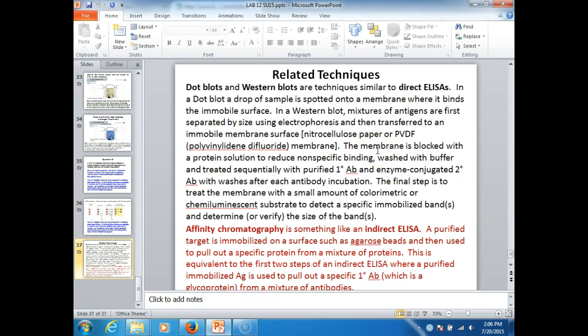So do most animals. And to give you an example, in today's experiment, we're going to be using a chicken antibody to then bind to an anti-chicken antibody produced in a rabbit, and then an anti-rabbit produced in a goat, right? So when you take antibodies from us and put them into another animal, they see it as a foreign protein, and they'll make an antibody against it. So the same is true for the chicken and the goat and the rabbit. You put antibodies from a goat into a rabbit, the rabbit's going to make antibodies against that goat, right? And so that's how they made the antibodies for our testing that we're going to do today.